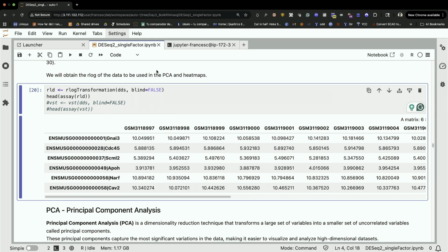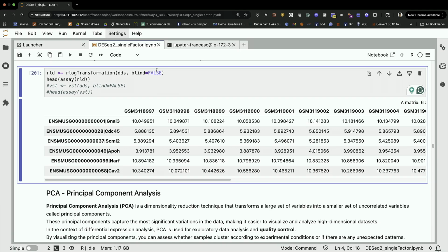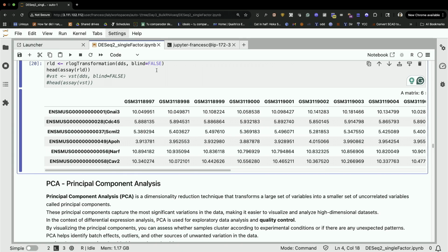I'm going to try to finish at least the PCA part before lunch, and then if it's still running, it still runs. At least it finished for me, which is the important thing.